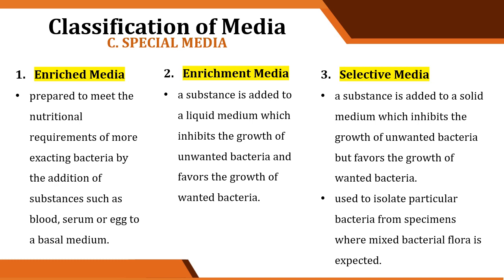It is a certain ingredient that some bacteria don't like and others do. And take note, it is a liquid medium. So, added to a liquid medium, the term is enrichment media.